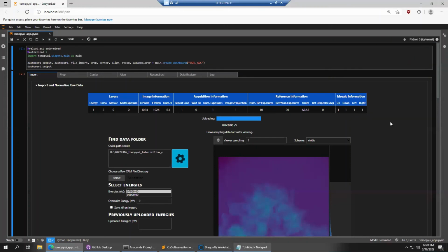You don't have to necessarily do that. I didn't have that feature until recently, but I've found that it does improve the quality of the alignment. I can also later include an option where you don't even have to go through that median filter process. You can just click an option to do the alignment on filtered data.